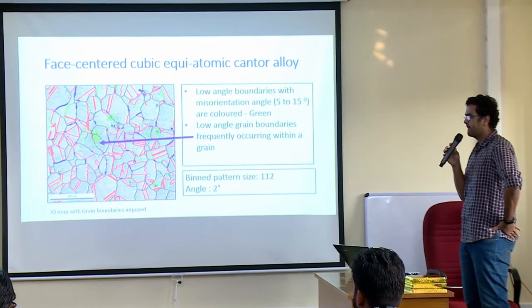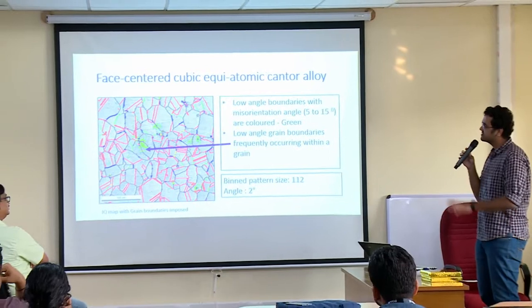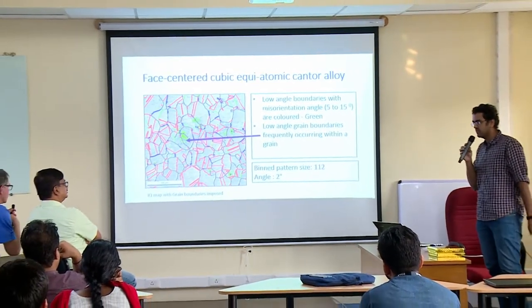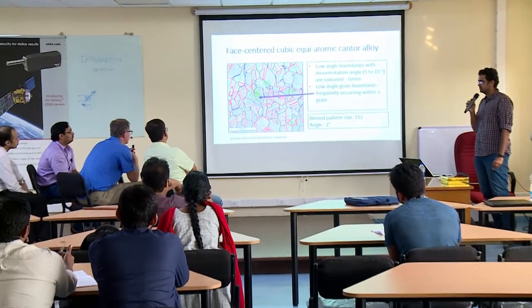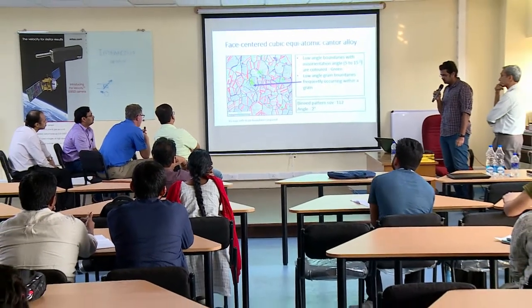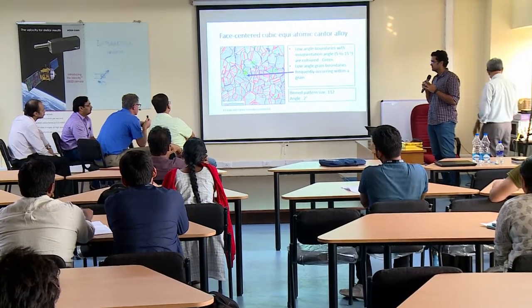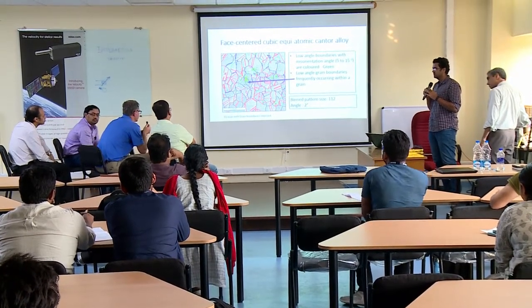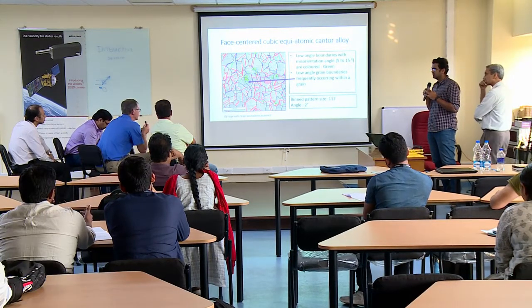In that case, it looks like the IQ is a little lower too, did you check? In other cases, the IQ is perfect, but we still find these. So it's not a pattern quality effect. When I've run into these problems, it often has to do with pattern shift. The calibration, the pattern center, is shifting as it moves around the sample.